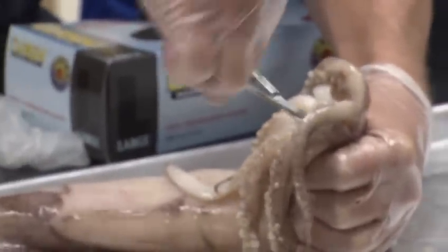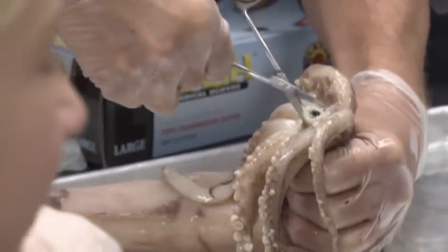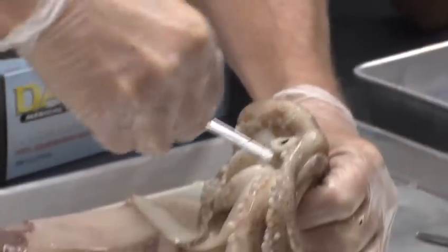This one won't squirt me, so I'm okay. So you just cut down. It kind of is like pulling out. Pass it around. Can everyone see that? Just feel it. It's fine. It's cool. It's really cool.